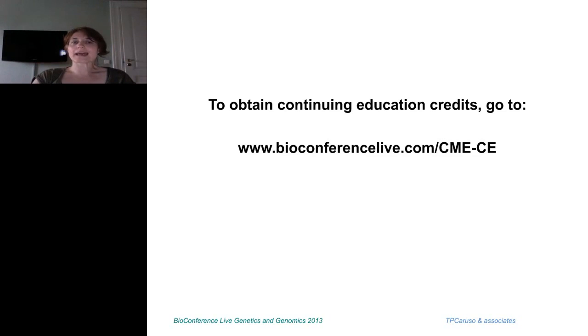Some labs have said that they're not going to do Sanger confirmation. And I think at the initial validation stage, you have to do it. Once you're really confident in your assay, you may get away without it. But as I said, good policy is to do it.